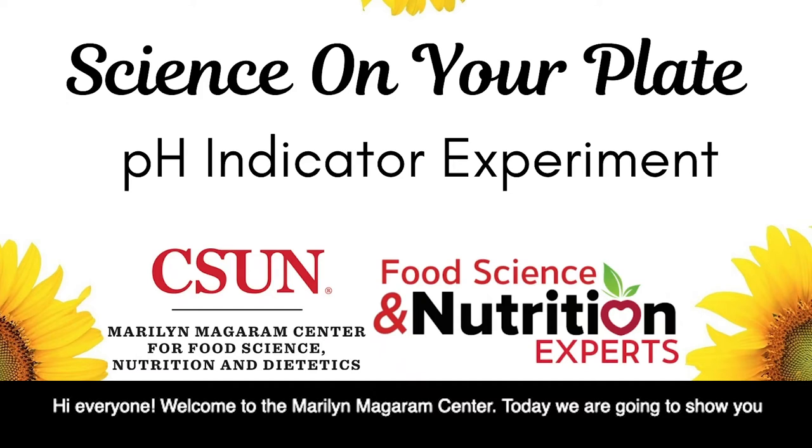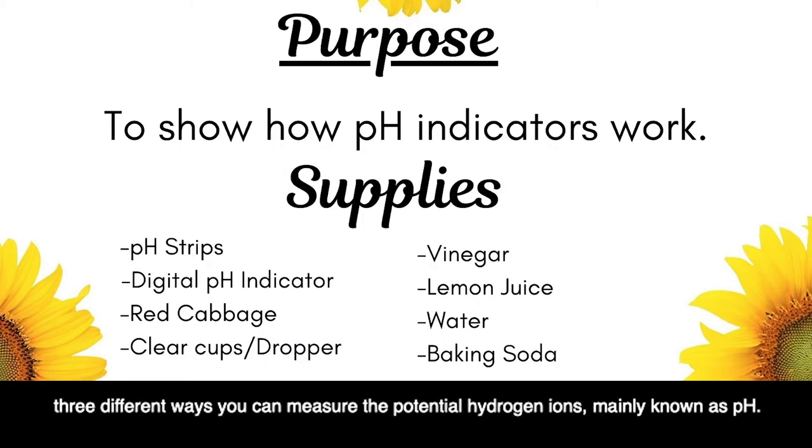Hey everyone, welcome to the Marilyn Magaram Center. Today we are going to show you three different ways you can measure the potential hydrogen ions, mainly known as pH.